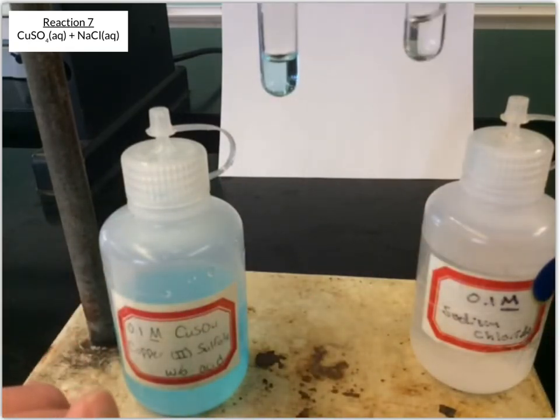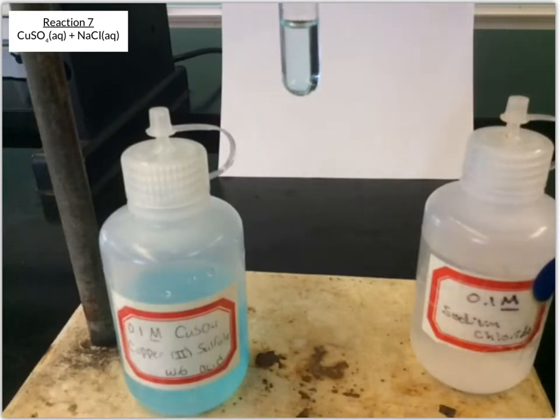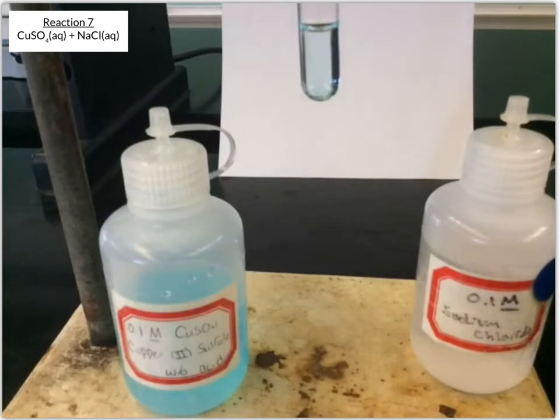So I'm going to take that sodium chloride solution and add it to the copper 2 sulfate solution.